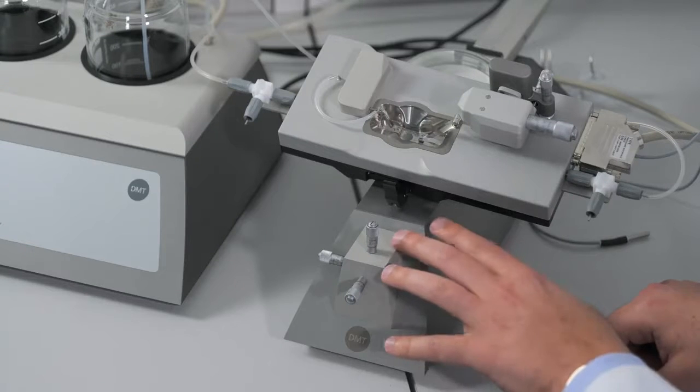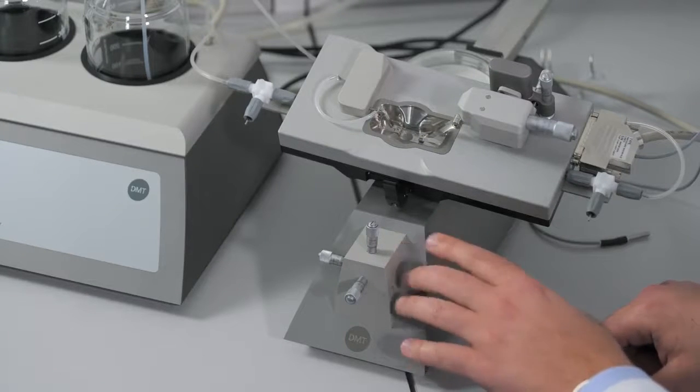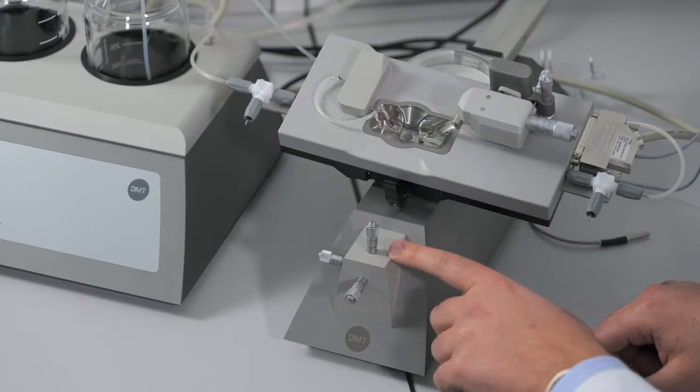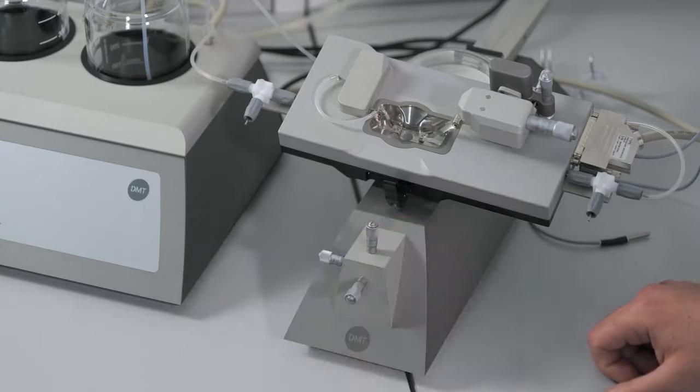The 114 chamber will sit on an inverted microscope. In this case, we are using a DMT microscope that has three-directional control of the objective.